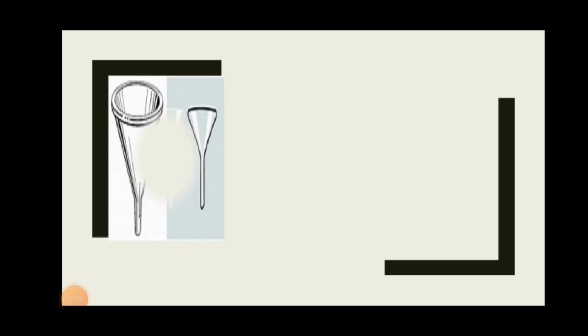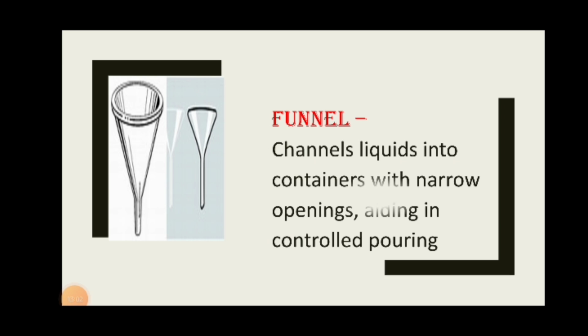And next is, yes, you are correct, funnel yan. Paano gamitin ang funnel? Siya ang magiging channel of liquids into containers with narrow openings, aiding controlled pouring.